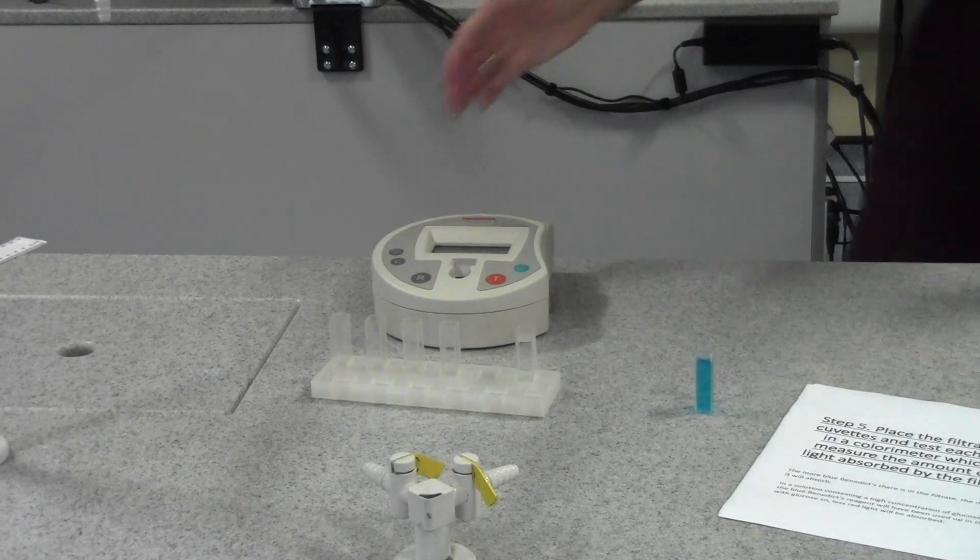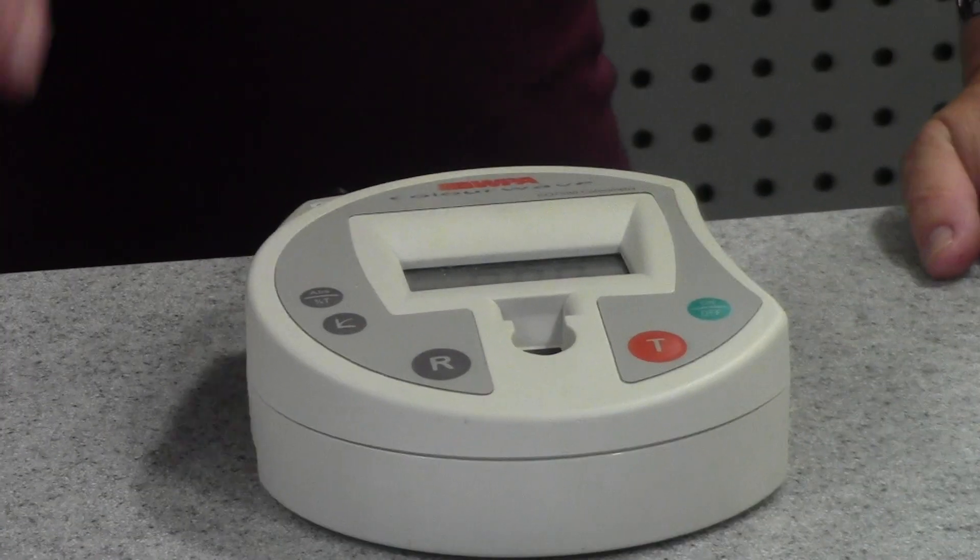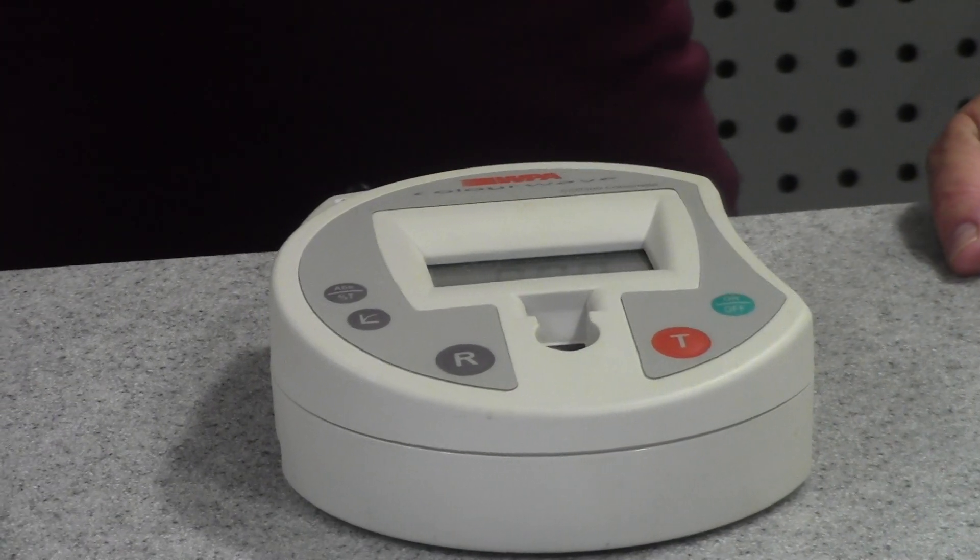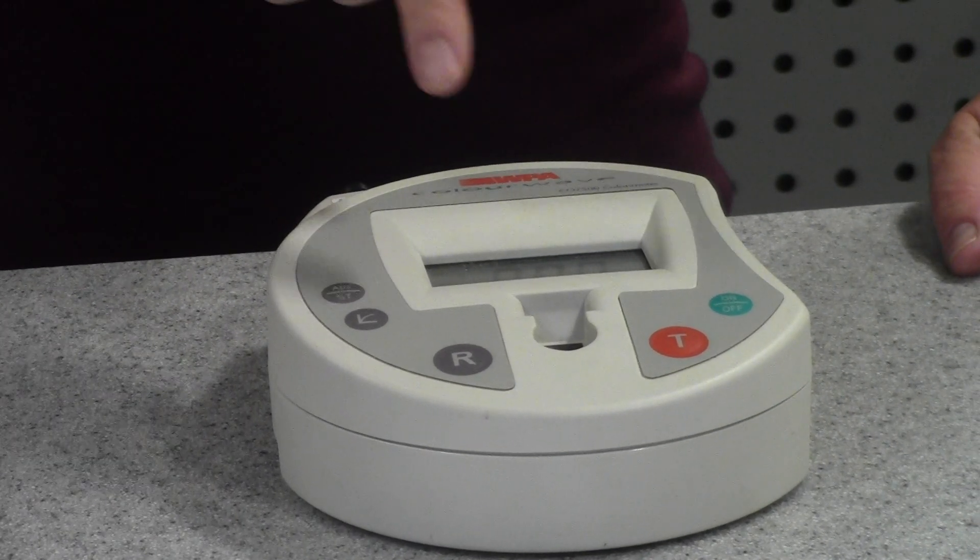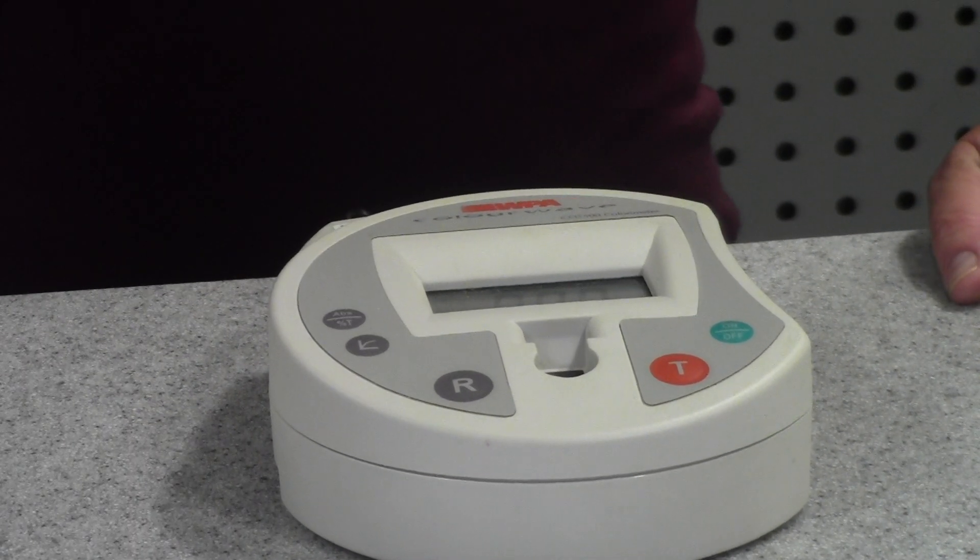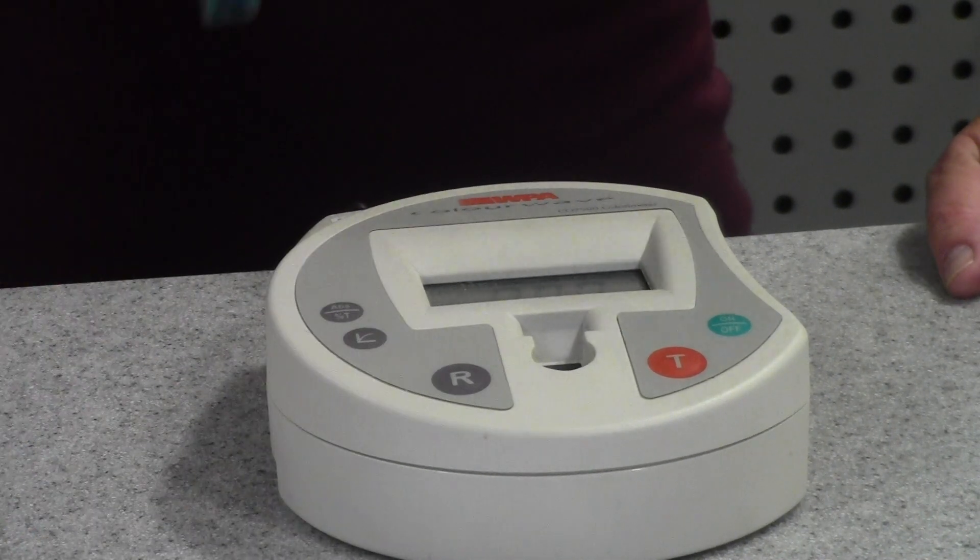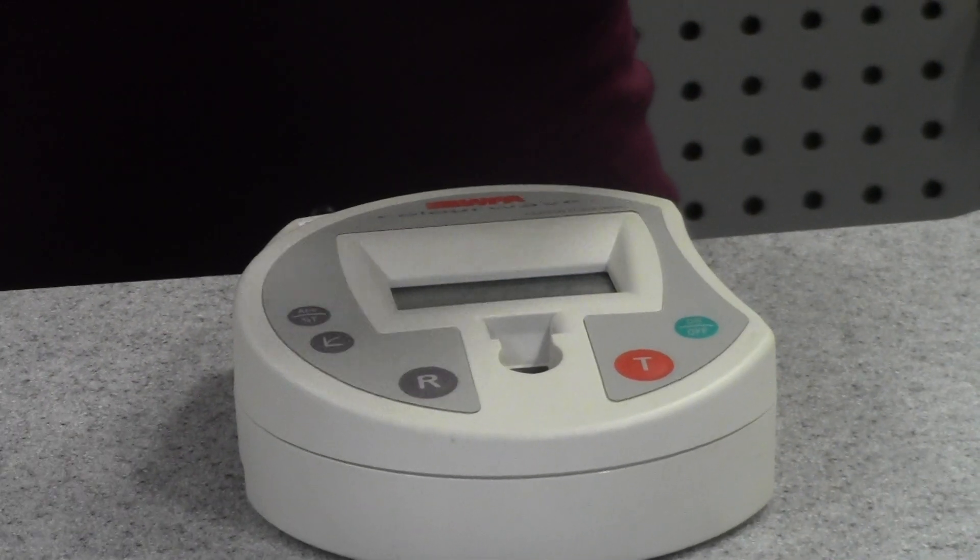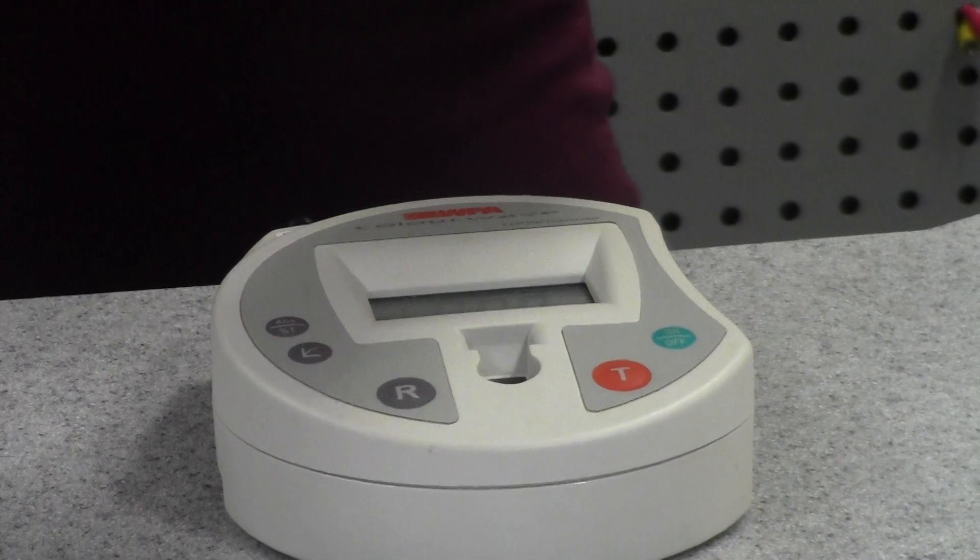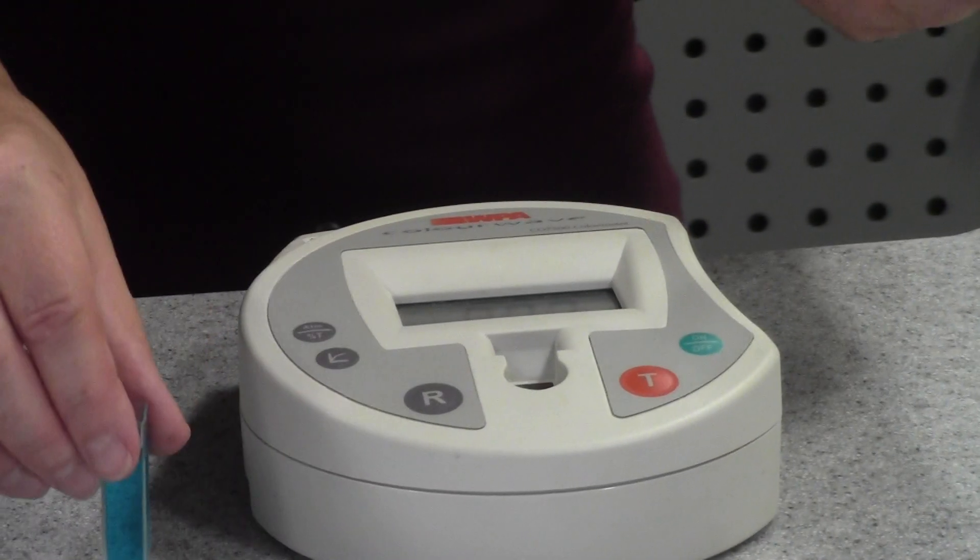This is a colorimeter, and the colorimeter measures the intensity of color in solutions. Now this one, I've set it with a red filter, so this is going to measure—it's going to shine a red light through the samples I place in there, and it's going to work out how much of that red has been absorbed. Now because this has got a lot of blue in it, it should absorb a lot of red light.